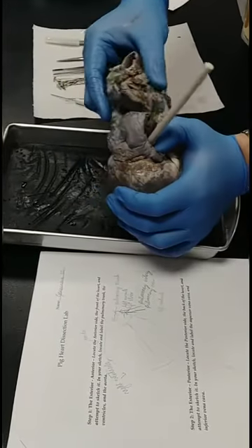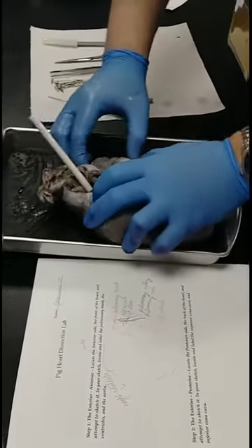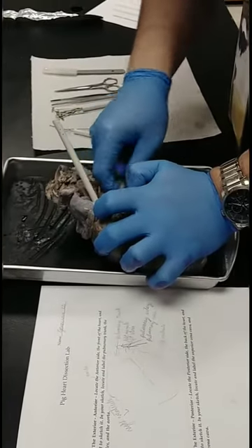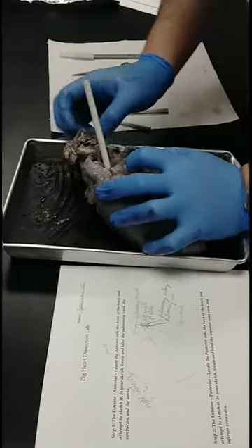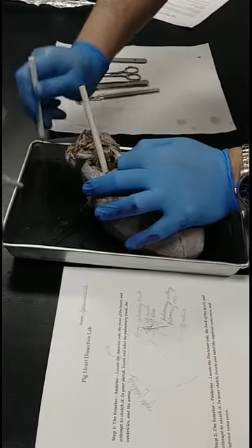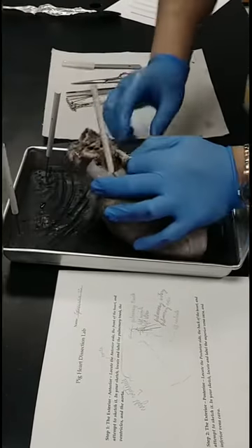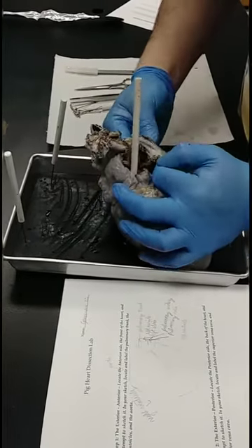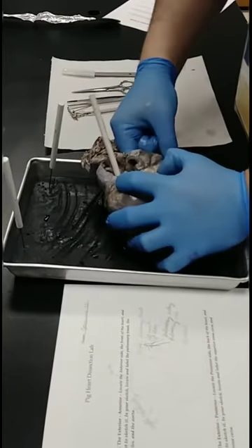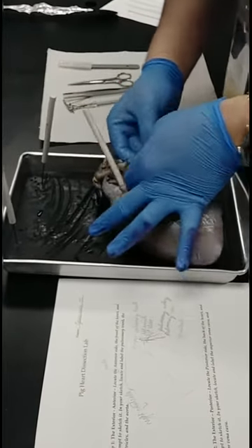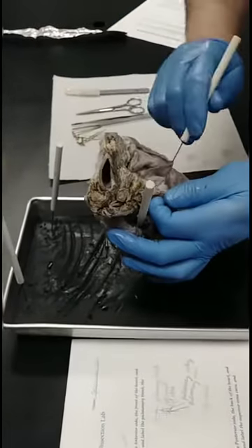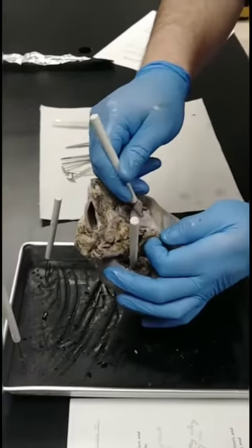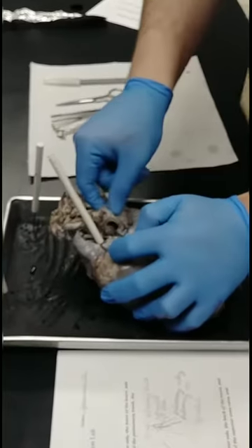See how thick this artery is? Just like the aorta up here. You want to find one of the very thin veins, which is a little bit collapsed right now. See how thin this is? This is part of the vena cava — it's very thin compared to the aorta. All it's doing is returning blood to the heart.